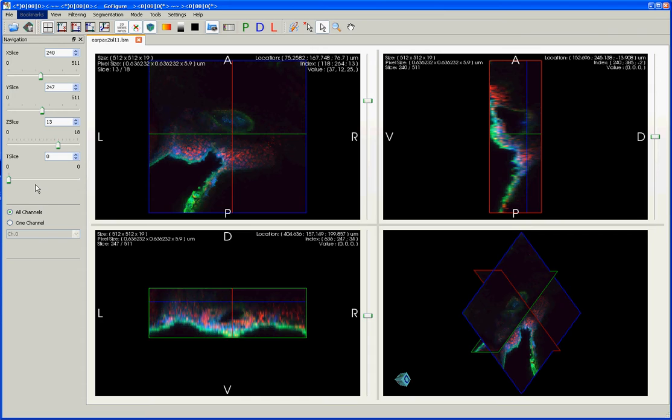This particular image is just a single time point, but if there were multiple time points in a 4D image, you could also navigate through the T slices using this slider here.